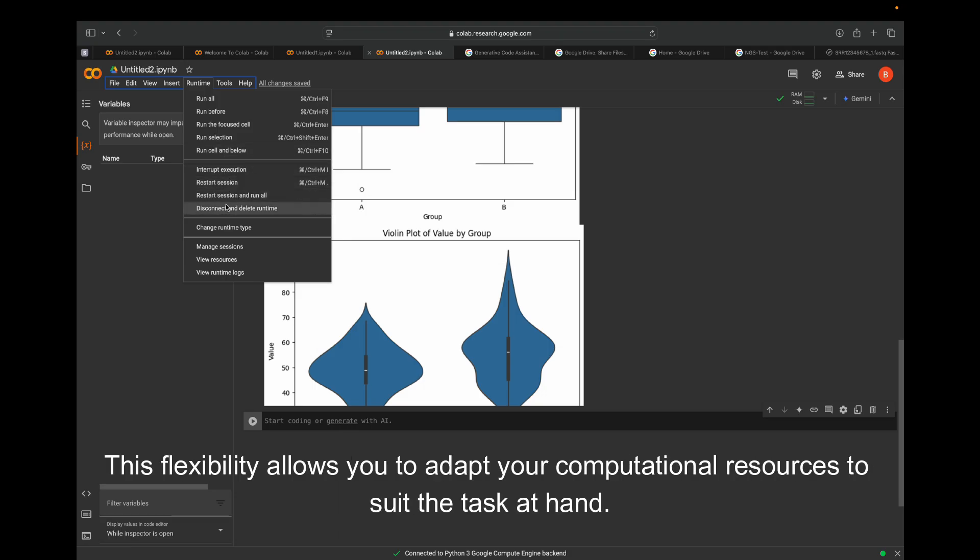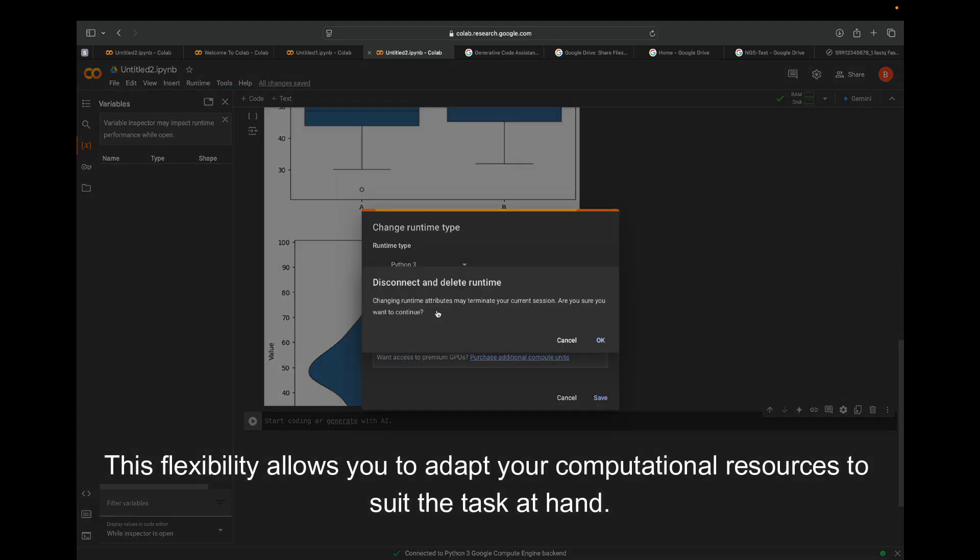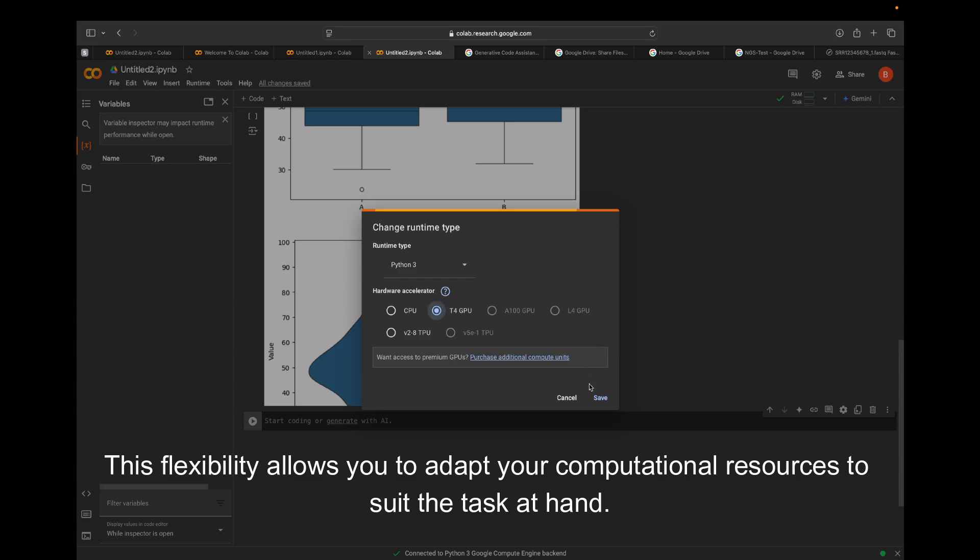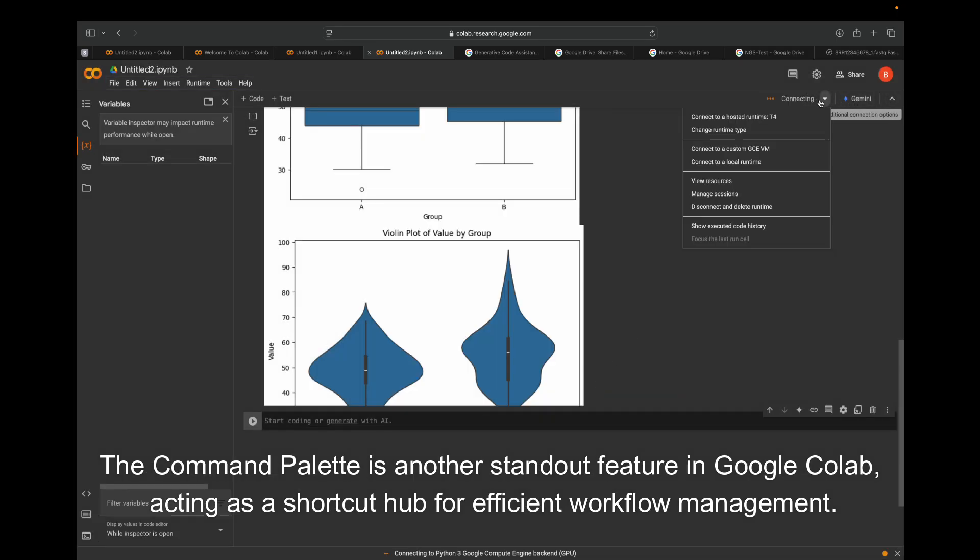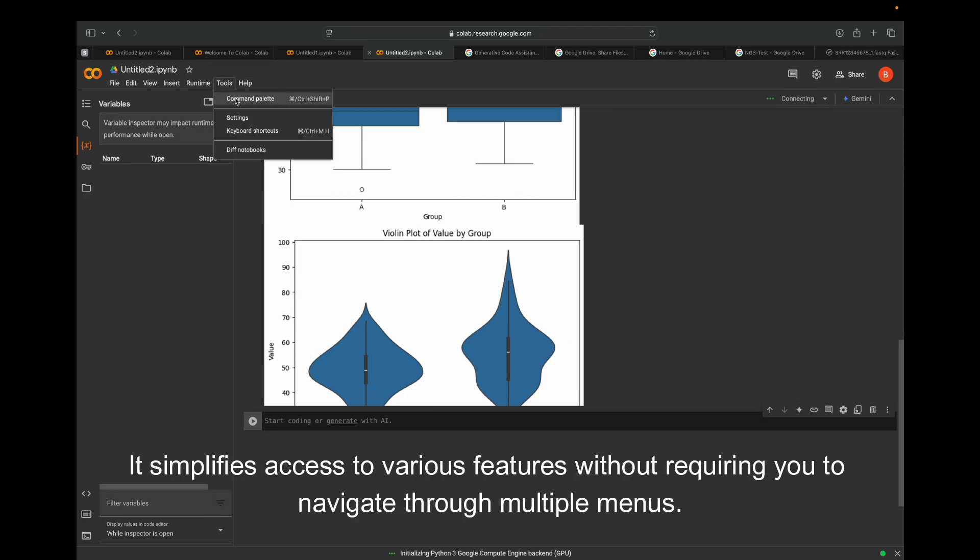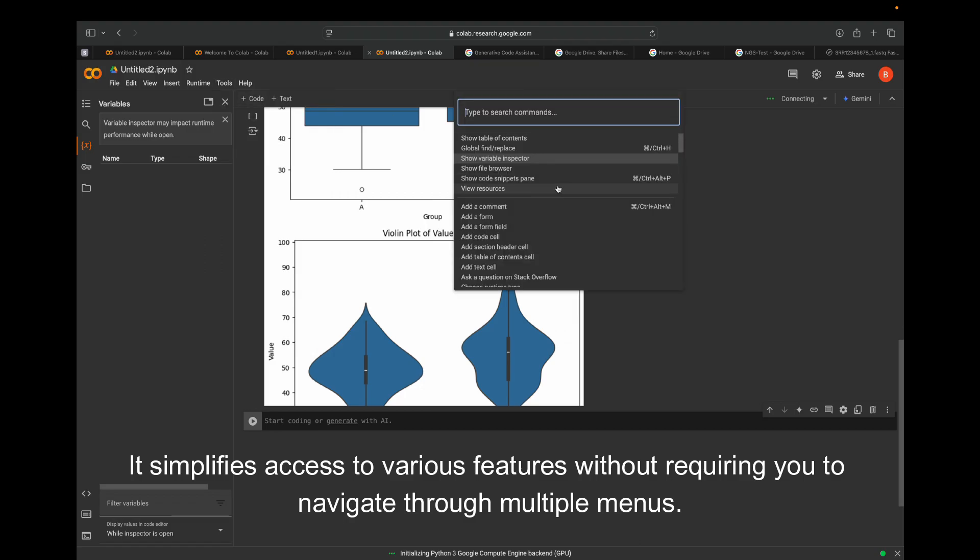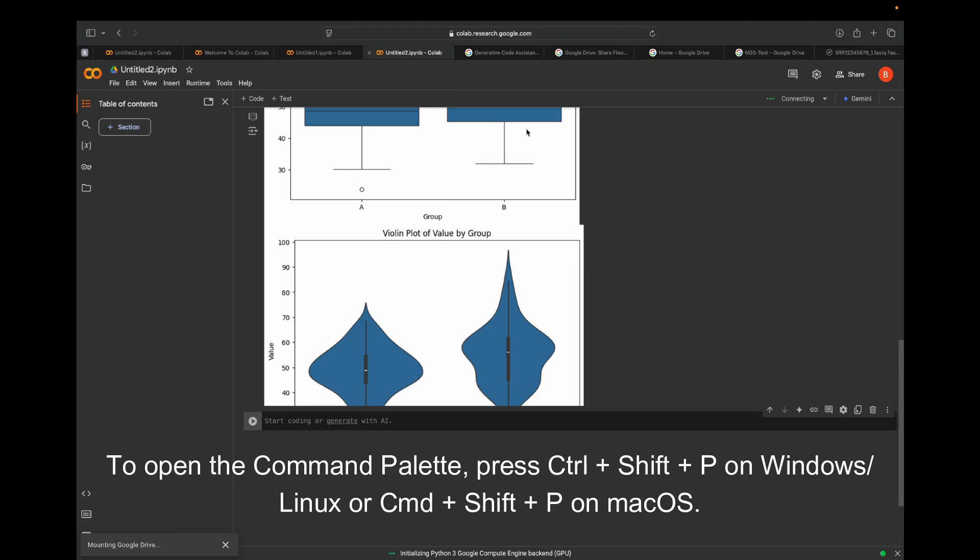The command palette is another standout feature in Google Colab, acting as a shortcut hub for efficient workflow management. It simplifies access to various features without requiring you to navigate through multiple menus.